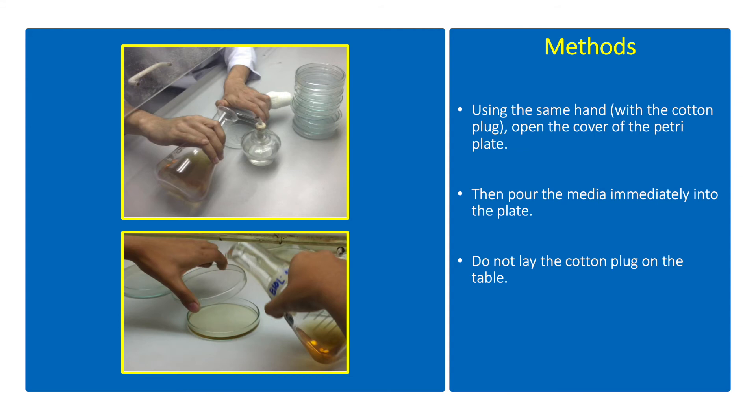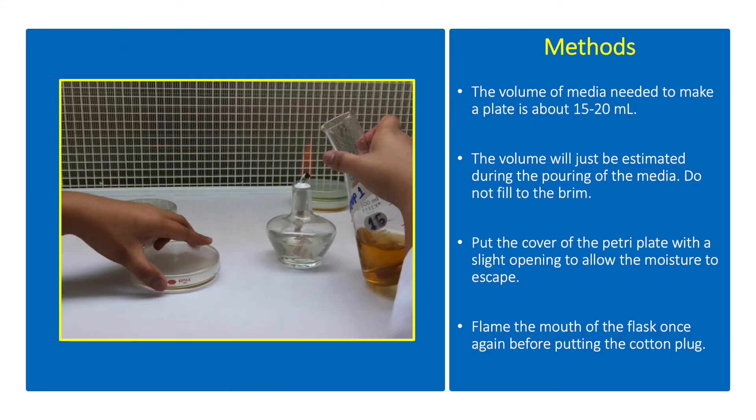Do not lay the cotton plug on the table. The volume of media needed to make a plate is about 15 to 20 ml. The volume will just be estimated during the pouring of the media. Do not fill to the brim. Put the cover of the petri plate with a slight opening to allow the moisture to escape.